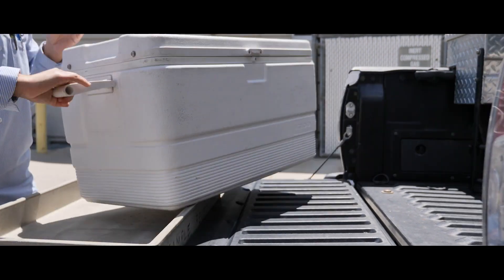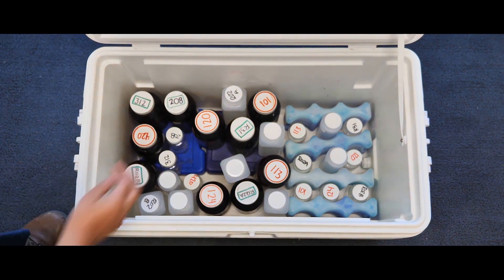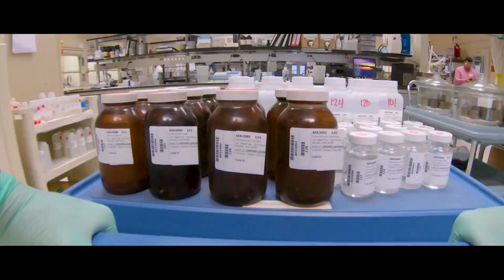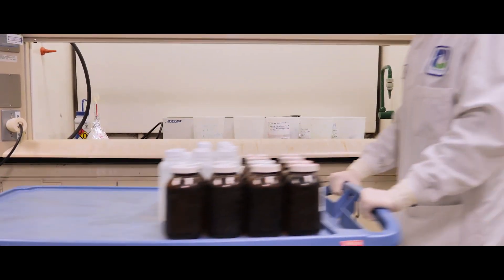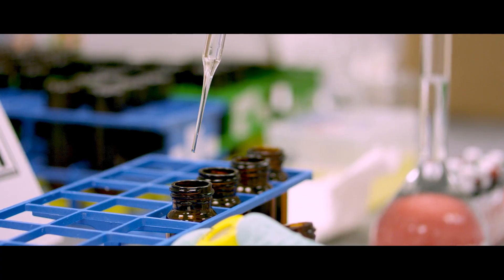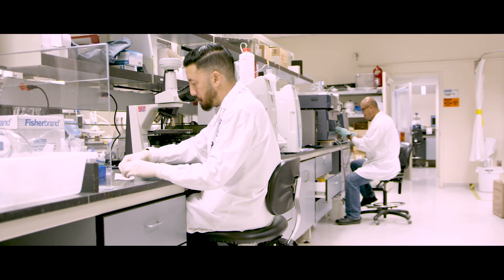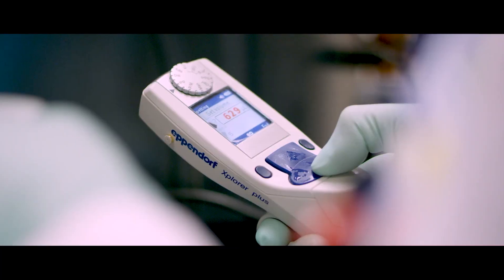In fact, every day, each of our scientists collects samples from up to 20 locations throughout the district to ensure you're getting the highest quality. Each year, we report more than 100,000 analytical results, screening your water for microbiological, organic chemical, inorganic chemical, and physical parameters.